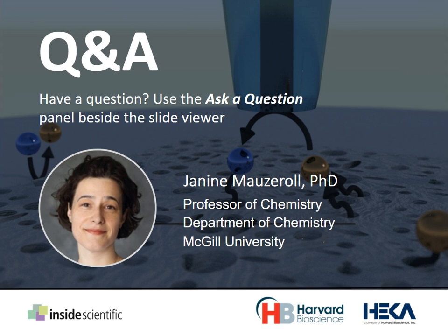Yes, etching surfaces and seeing whether or not the etched surface, or in some cases, you know, in microfabrication, you also have copper deposition. SECM has been used in this field. There are a few papers that I'm aware of, in the Q&A answers that I'll do tomorrow, I can provide some reference ideas, but definitely it's possible to use it.